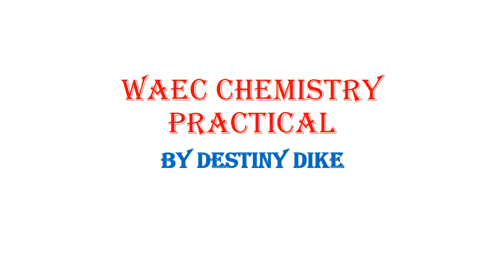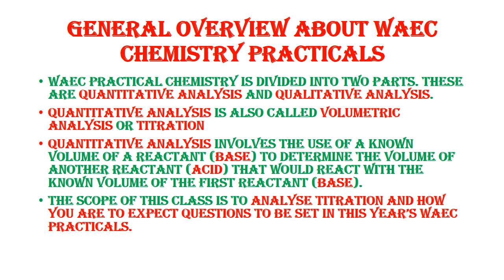All right, so we are going to be considering Waec chemistry practical. The chemistry practical we are going to consider is titration, which is the practical that has the highest marks. The calculation, what do you expect? You can see the general overview about Waec chemistry practicals. I will just go through it with a little explanation.